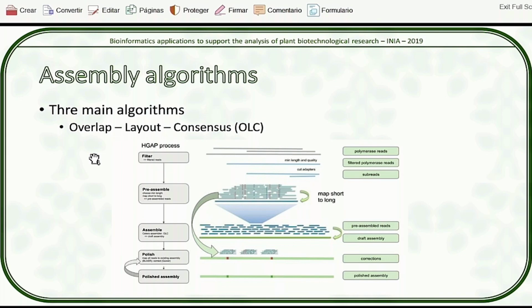So this is the HGAP process, and they've refined it, and they developed another assembler called Canu, which follows pretty much the same approach. And then after that, they even improved it, and they created Falcon, which improves on top of Canu and generates better, faster overlap algorithms. And then now they've created FALCON-Unzip, which is able to phase a genome assembly. And what do I mean by phasing? It's the same thing I mean when you genotype something. You can tell which haplotypes belong to each of the parental chromosomes, to each of the homologous chromosomes. Is that a clear idea?